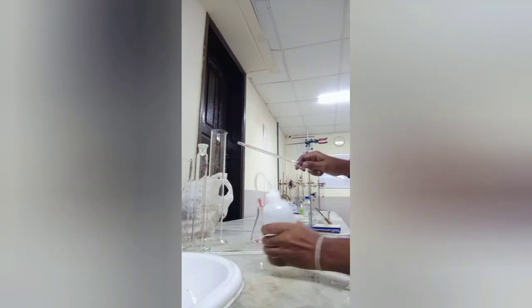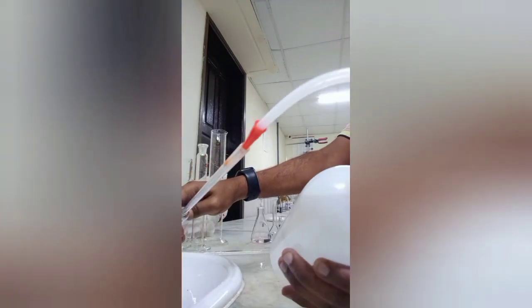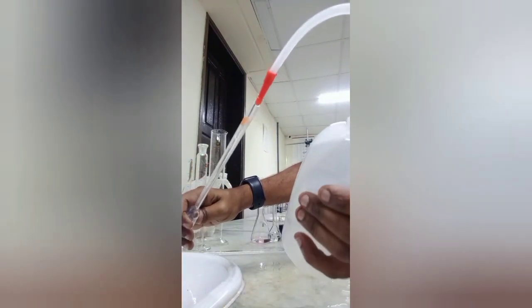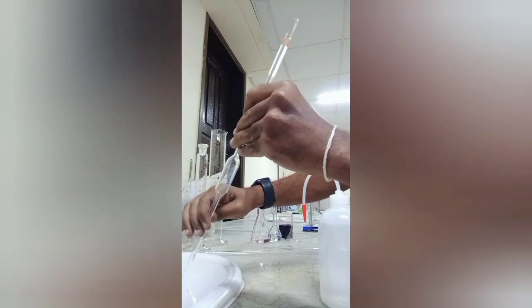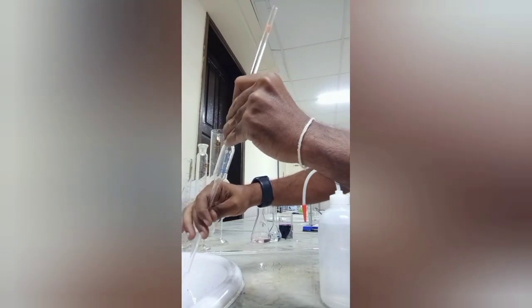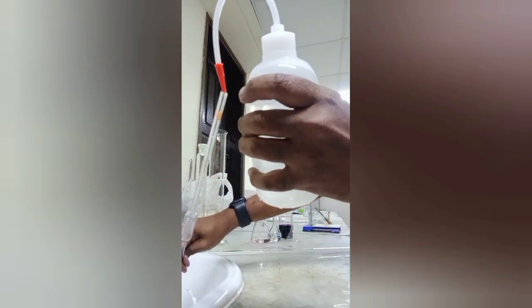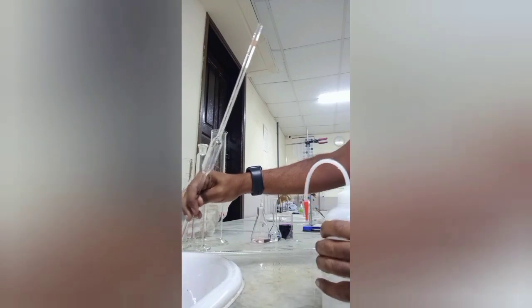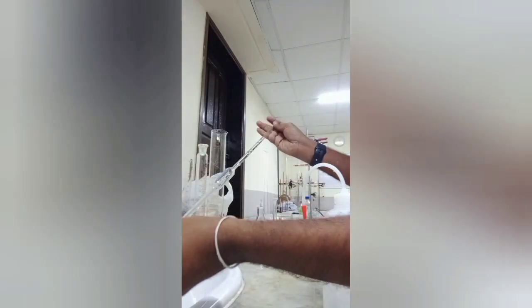And everybody, you want to know how to wash the pipette. You want to wash like this. Use the wash bottle. If you keep it in the mouth, just don't press, it will go very strong. So after finishing, all the instruments and all the glassware you used, you want to wash them. Two times or three times is enough. Like this also you can do. Before doing, you can do like this.